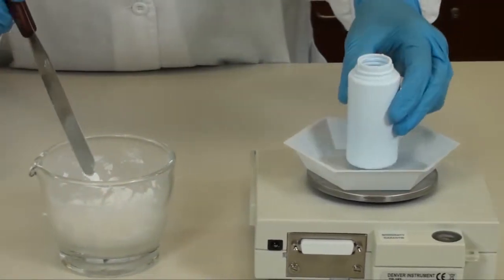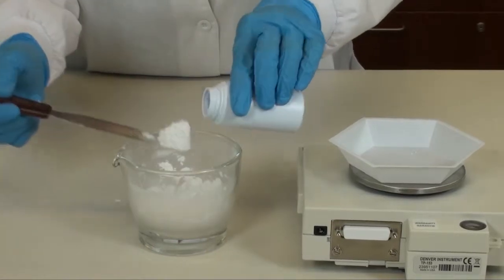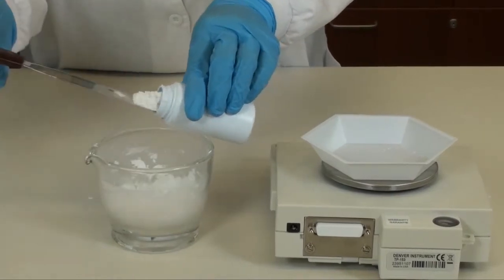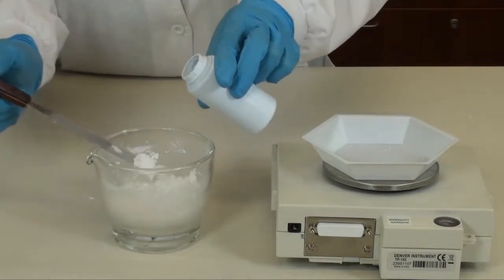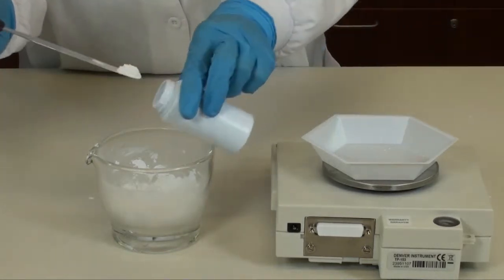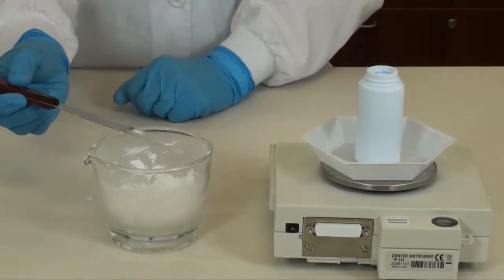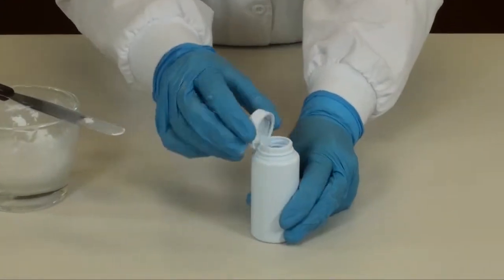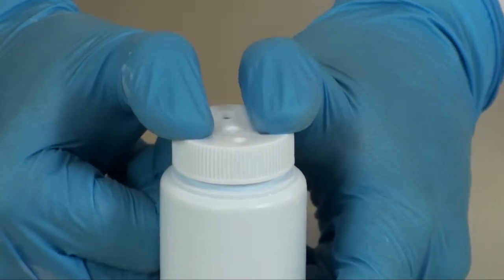Periodically check to see how close you are to your target weight. You should now be at your target weight. You're now ready to cap your shaker bottle. Place the cap firmly on and then go ahead and press it till it snaps.